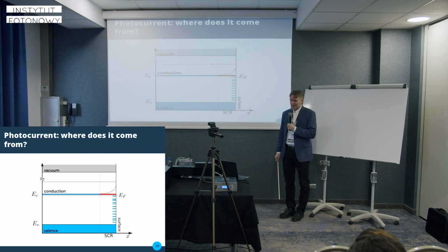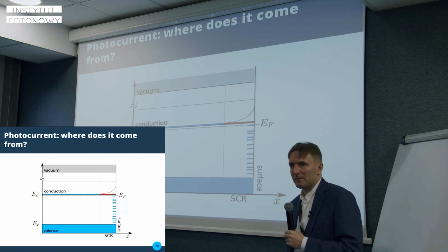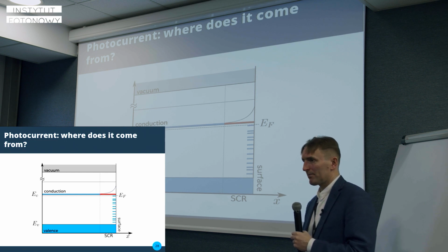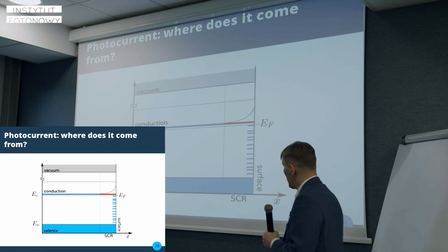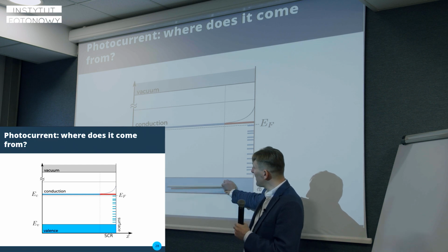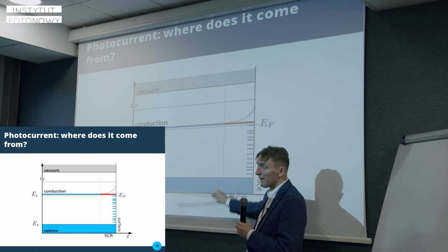Now you can do this Gedanken experiment. You can remove all the electrons from the sample altogether and put them back one by one, until we fill this valence band. They will go from the lowest energy levels up to this point.